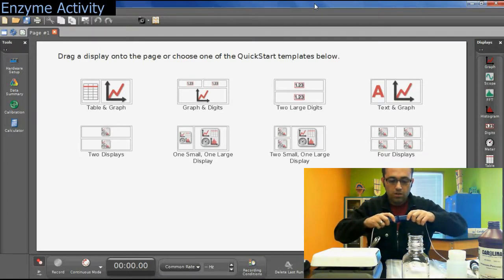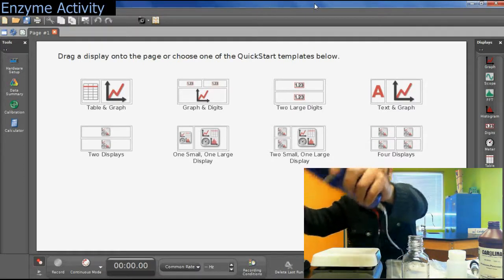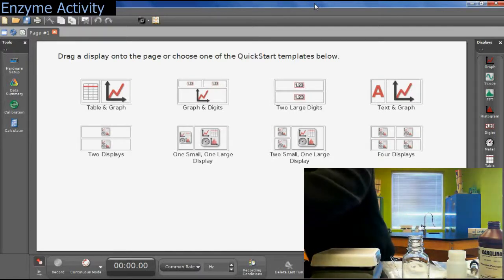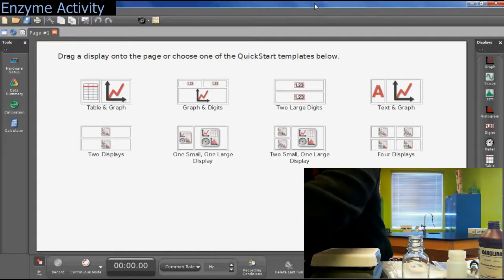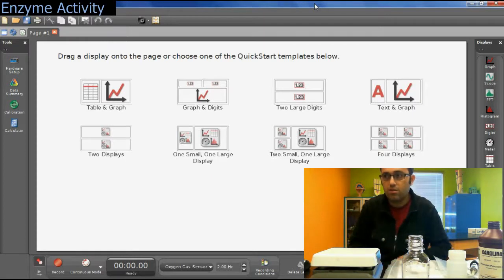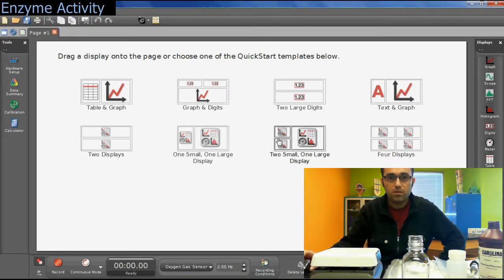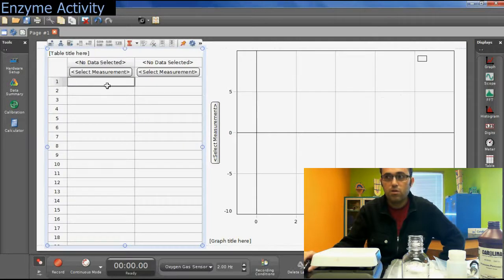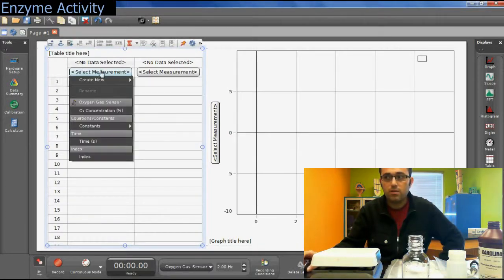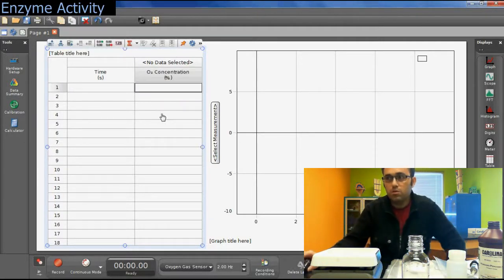You connect your oxygen sensor into the USB link and then connect the USB link to your laptop. Capstone is already running on my computer and it recognized the oxygen sensor as soon as I plugged it in. There are many choices on the first screen of Capstone — you're going to select table and graph, then set time for your x-axis and oxygen concentration for your y-axis in both the data table and the graph.